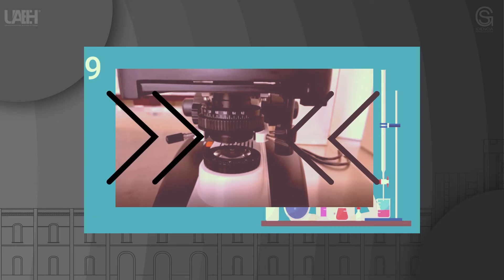Step 9: To improve the quality of the image, you can adjust the condenser or the diaphragm again to regulate the amount of light that illuminates the sample.